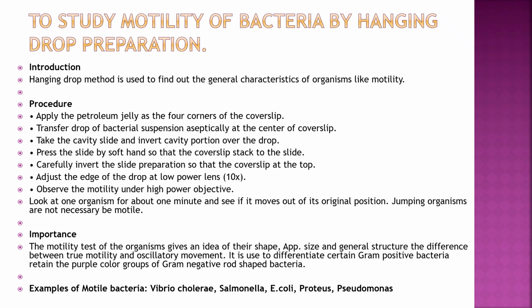To study motility of bacteria by hanging drop preparation. It is used to know the motility of the bacteria. Procedure: apply petroleum jelly at the four corners of the cover slip. Transfer a drop of bacterial suspension to the center of the cover slip. Then take a cavity slide and invert the cavity portion over the drop. Press the slide gently so that the cover slip sticks to the slide.